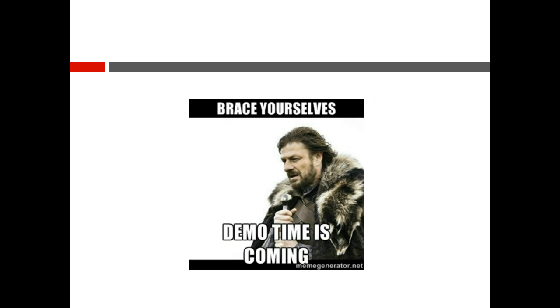So now it's time for another demo. In this, it's actually 2 videos back to back. The first one will be showing the autofocus function. The second one showing both autofocus and auto approach in a different way. So we'll be back in a moment.